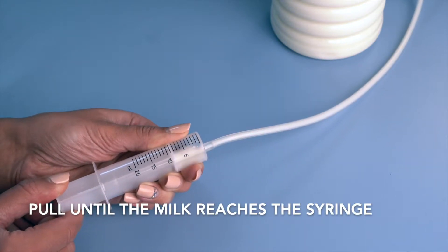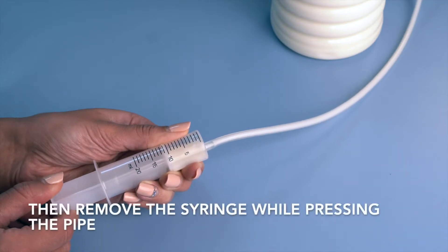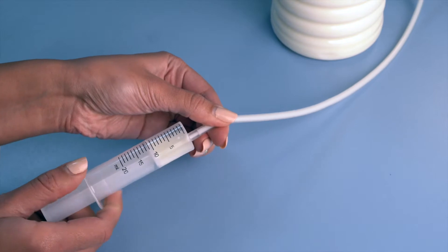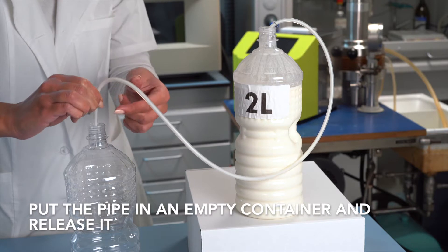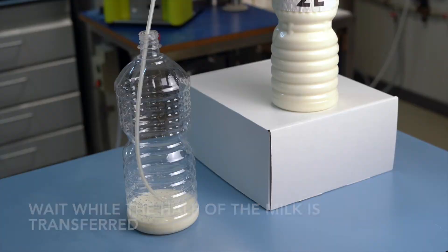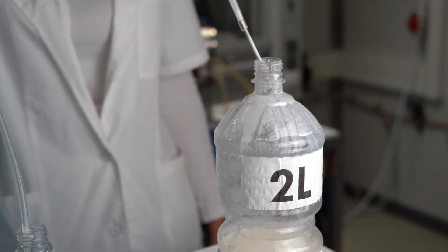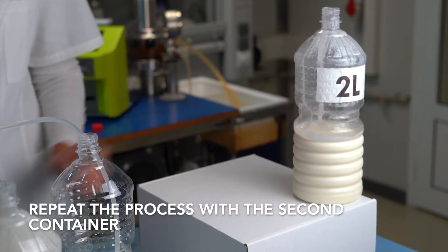Pull until the milk reaches the syringe, then remove the syringe while pressing the pipe. Put the pipe in the empty container and release it. Wait while half of the milk is transferred. Repeat the process with the second container.